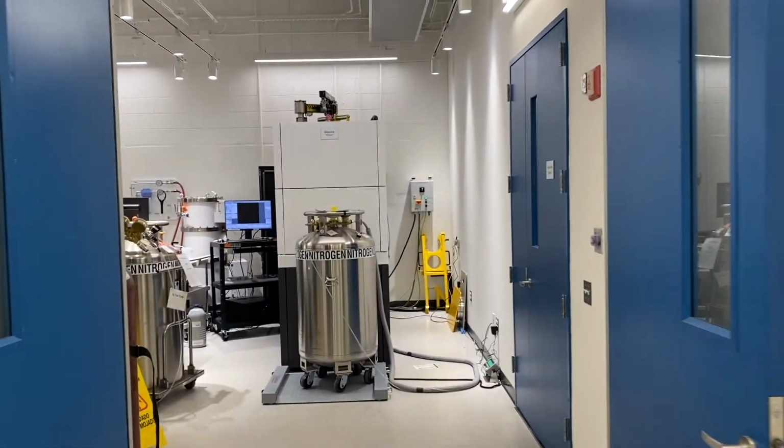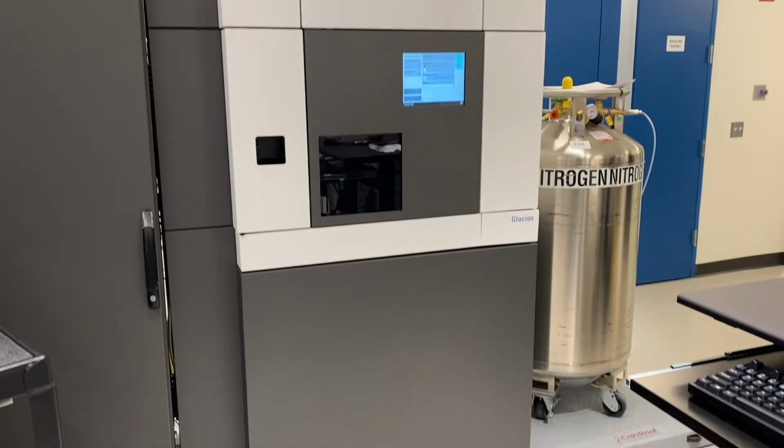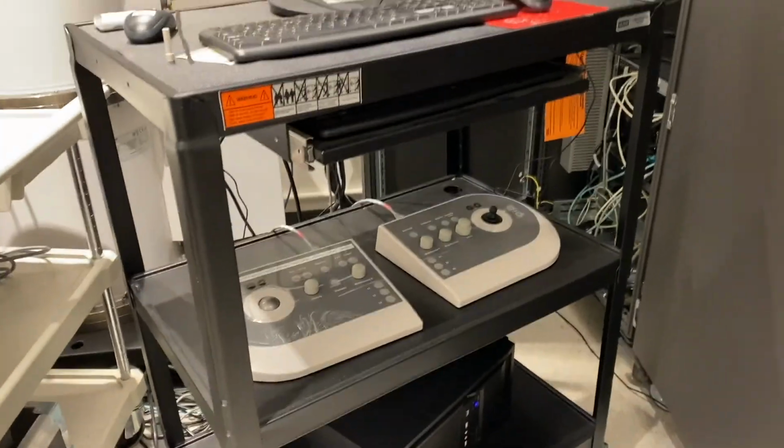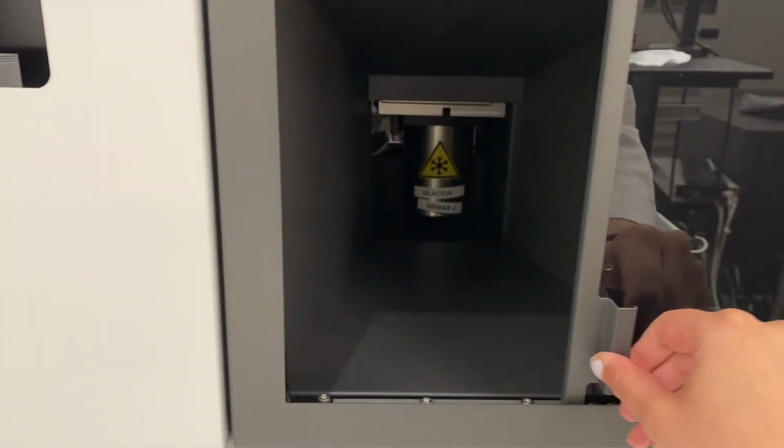I'd like to introduce you to Allison. She is our Glacios Cryo-TEM created by Thermo Scientific. This is a 200 kilovolt FEG screening microscope with an autoloader. This is our microscope PC with hand panels. Over here is our loading interface, and behind this window is where we can load our nanocabs.